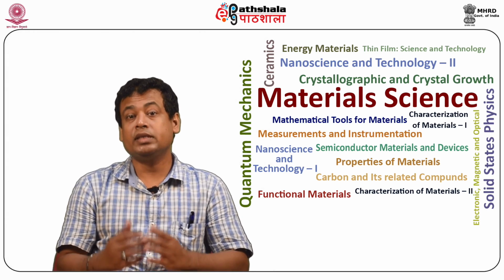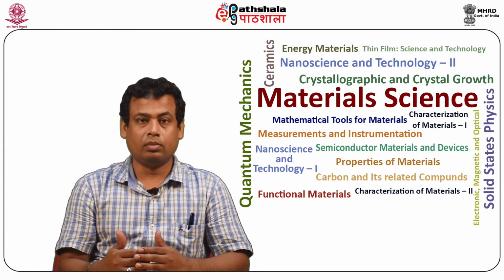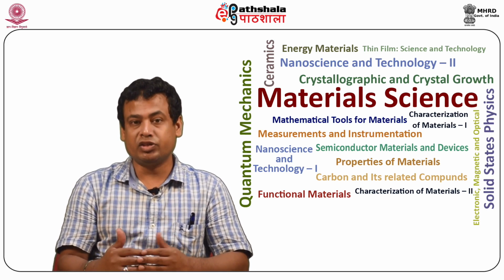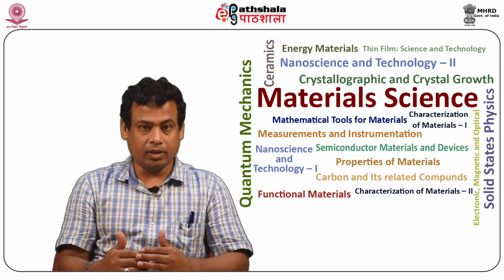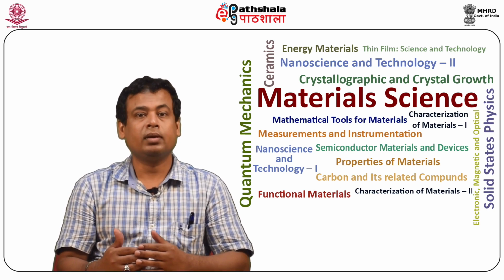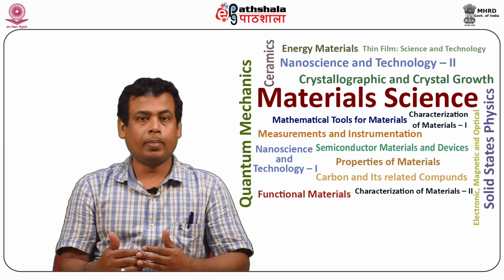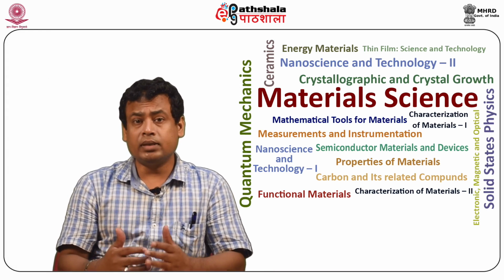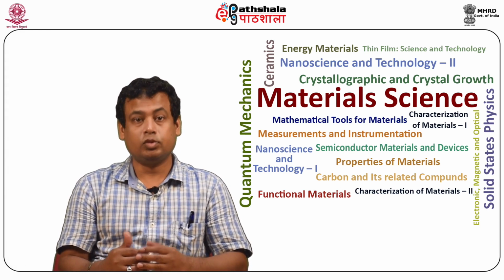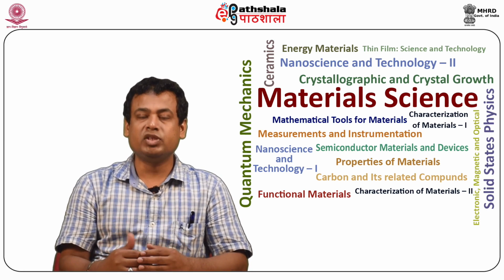Electron beam lithography is used to create nanoscale patterns by exposing the electron beam of a scanning electron microscope, termed SEM, to a sensitive chemical termed E-beam resist. Generally, a SEM system with nanopattern generator system, termed NPGS, hardware and software could work as an E-beam lithography system. Pattern design of the required features to be written on the E-beam resist is programmed using computer aided design, termed CAD, or CAD based NPGS software.